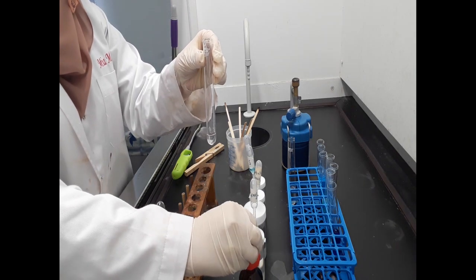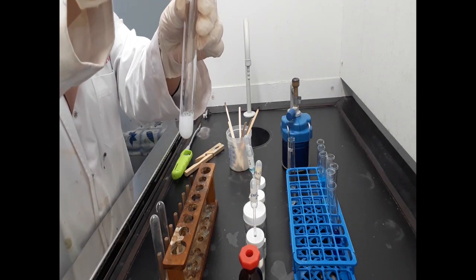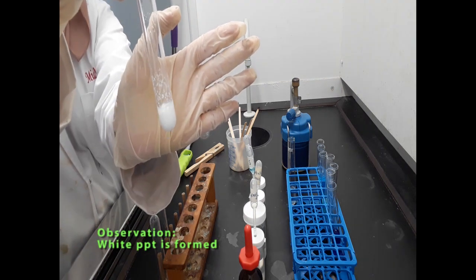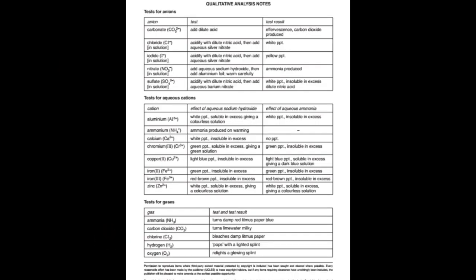And then to the other half of the mixture from A, add an equal volume of aqueous silver nitrate. White precipitate is formed. So by referring to the qualitative analysis notes, for solution R, I can say that there is no sulfate at all because it does not give white precipitate during the addition of aqueous barium nitrate. However, it gives white precipitate when aqueous silver nitrate is added to the solution. Therefore, the anion is chloride.